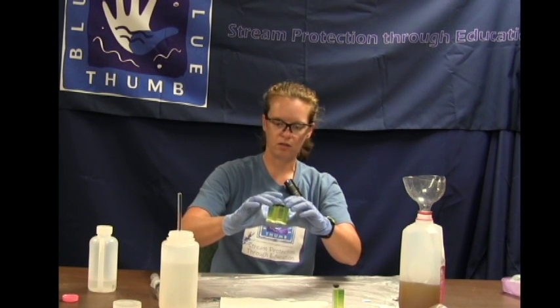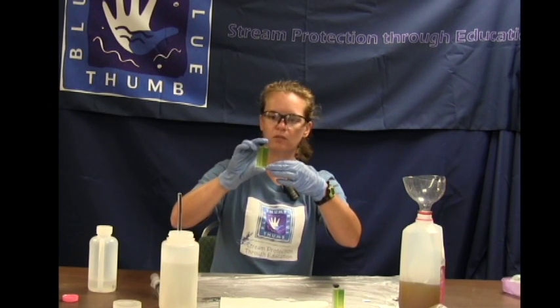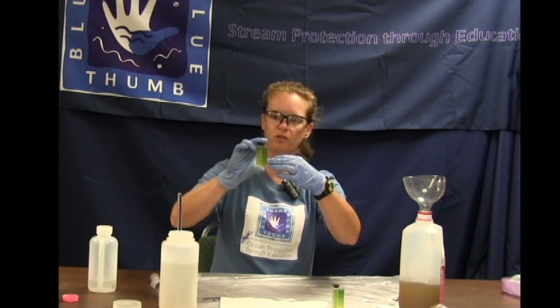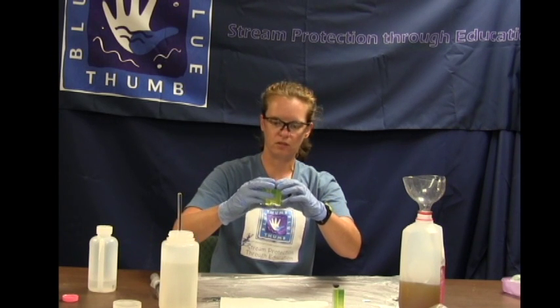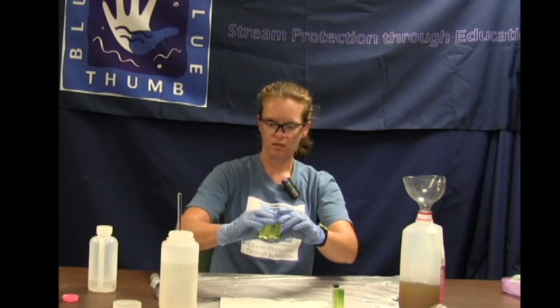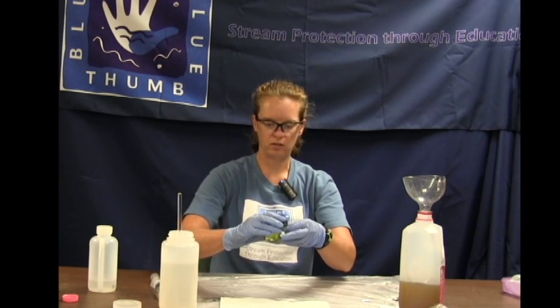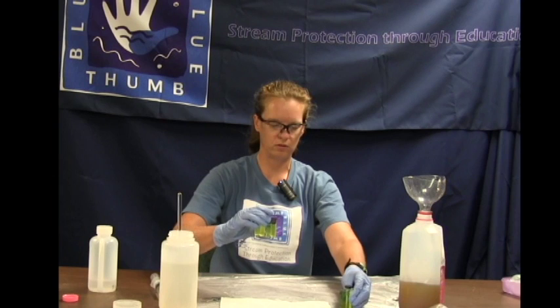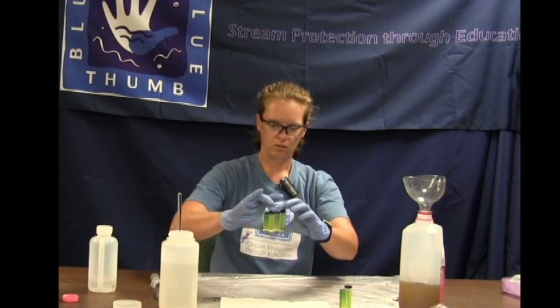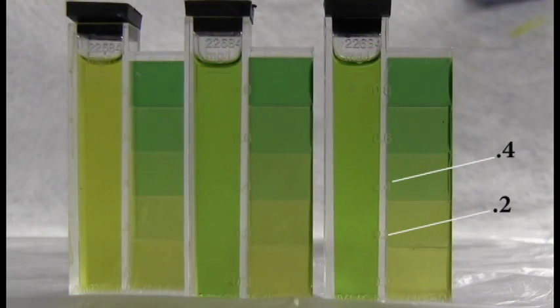And so our blank stayed at the very yellow bottom color, so that's 0.0. The next green color is 0.2, and so on and so forth. They increment at 0.2s. So our creek water is looking at somewhere between a 0.2 and a 0.4. So I'd actually call it a 0.3. And I'm going to look at our second creek water just to make certain that that one's looking the same way, and that it is between 0.2 and 0.4, so 0.3 on both ammonia cubes for the creek water tests.